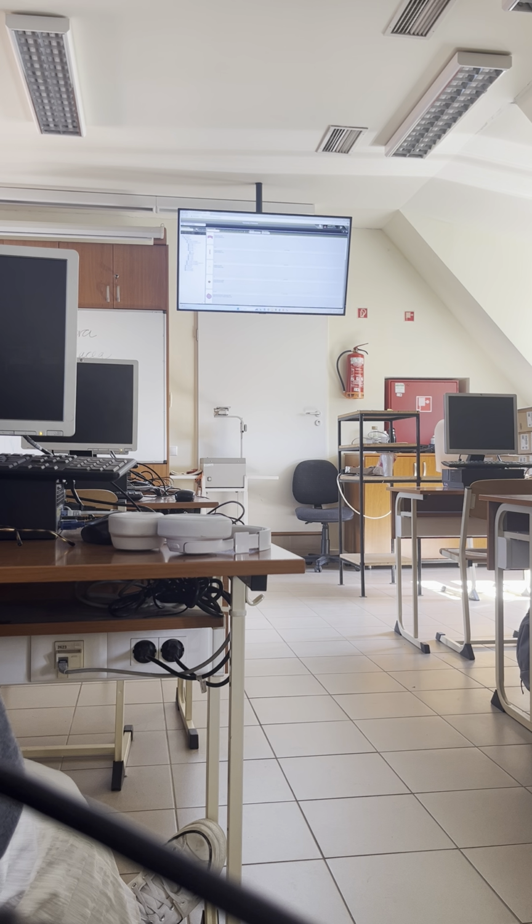Nothing too much special here relative to the other urinary bladder slides. This is just a thinner-walled urinary bladder, which may have two different reasons why the wall is thinner here. One is natural biological variability, but maybe this is too big a variability, because this wall is, I would say, at least 5 times thicker than this one, if magnifications are identical, but I don't know.